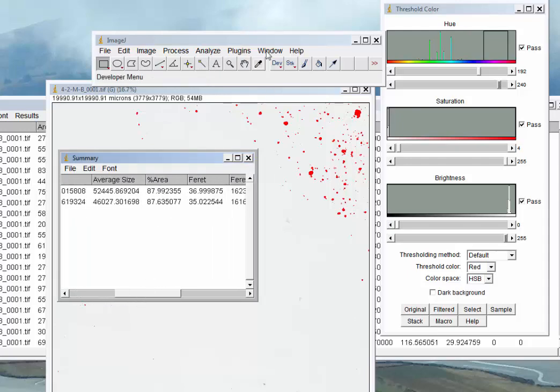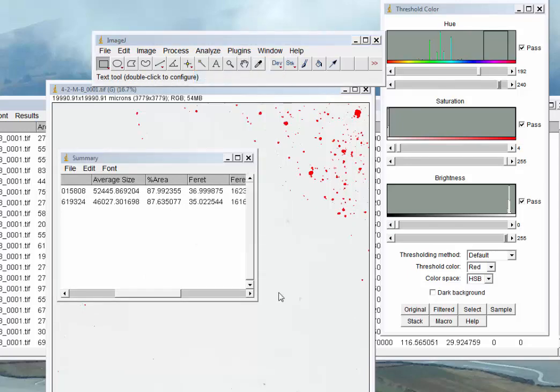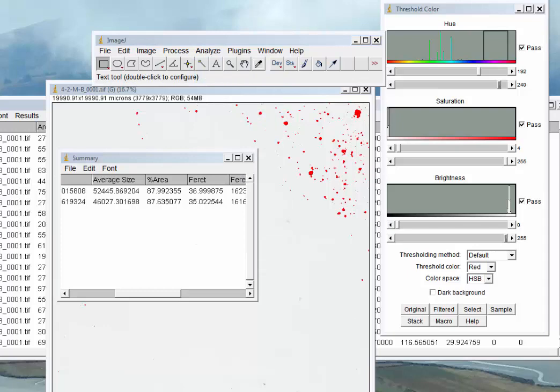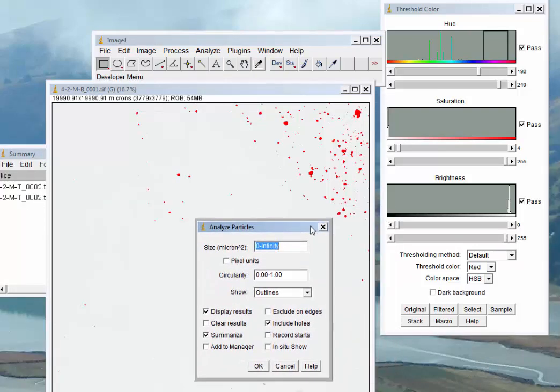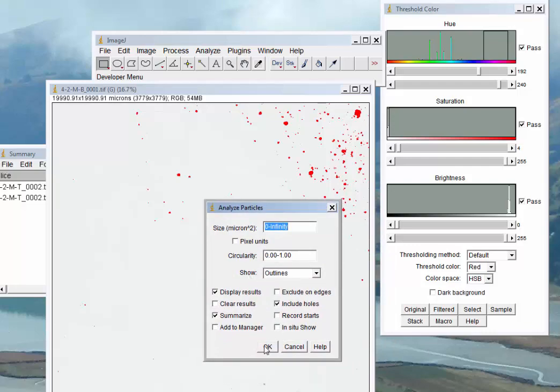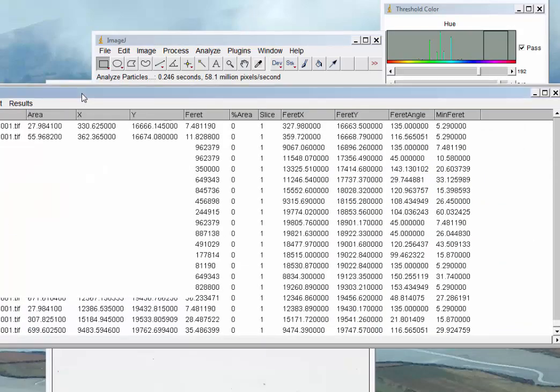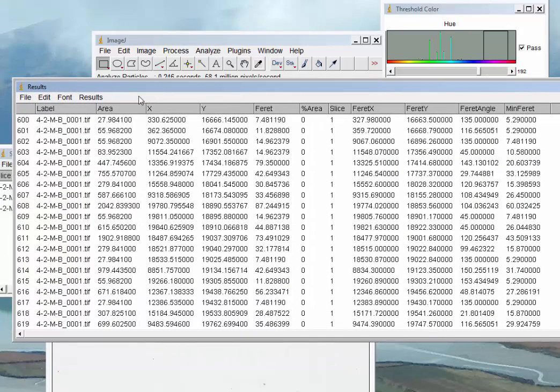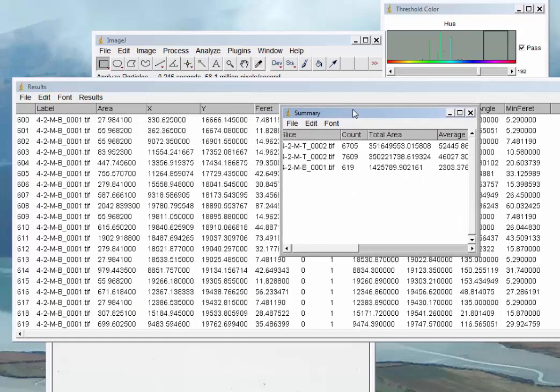I've changed our mask color to red to facilitate the next analysis. Here's our prior card with heavy coverage at 87% coverage. Now we're going to run this card, which is going to be obviously a lot less than 87%. We'll run our Analyze Particles, change the background to red, and show outlines on this analysis.